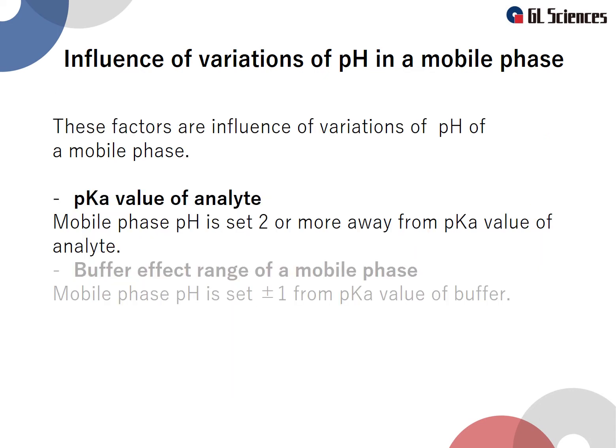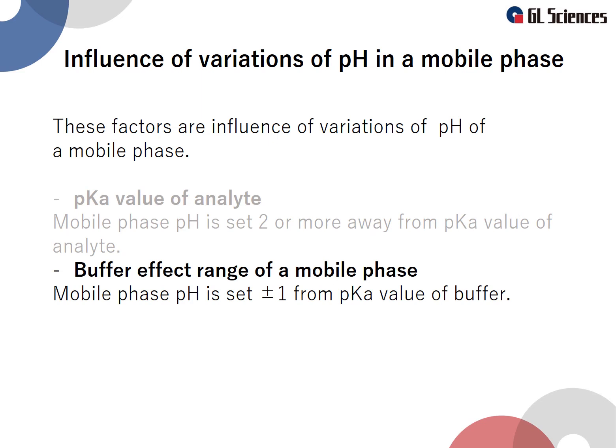We recommend setting the pH of the mobile phase in these ranges as much as possible. When focusing on your analyte, the mobile phase pH is set 2 or more above or below the pKa value of the analyte. When focusing on your buffer, the mobile phase pH should be between the pKa value minus 1 and the pKa value plus 1. Please make sure to note these two distinct guidelines.